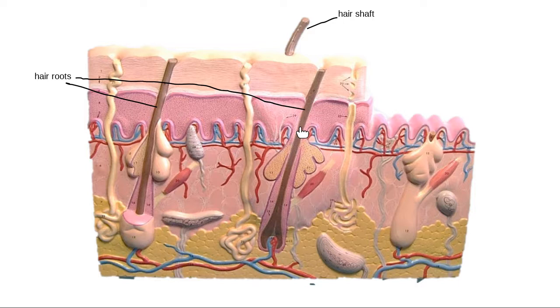When we're looking at the root of a hair, there are a couple of things that are attached to it. The first thing that we see is right here. So let me do some labeling here. Use blue. So the first things that we see, and we see them attached on all of our hairs, these things with blue circles, these are called sebaceous glands. Sebaceous glands. Ooh, I spelled that wrong. Let me fix it so it doesn't throw us off.